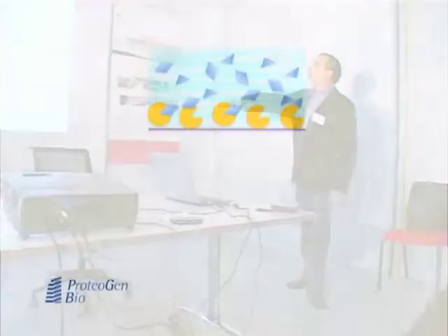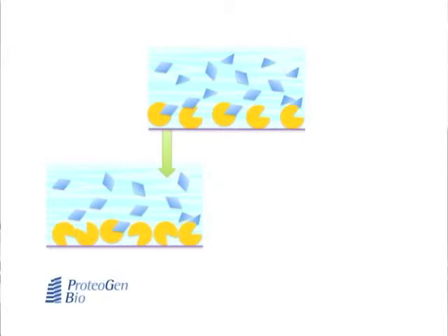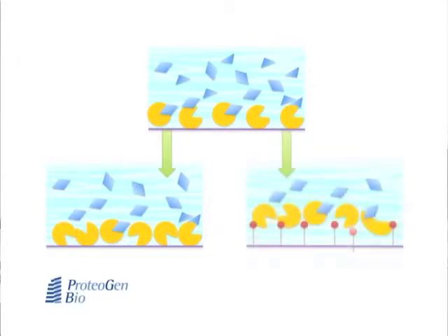When the peptidase is immobilized on the surface, self-digestion is not allowed, and then the only result is a mixture of peptides originating from the protein to digest.